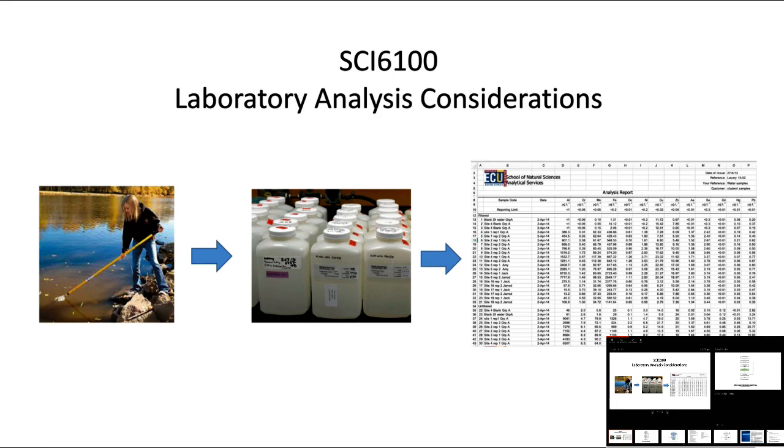You may do that in your own laboratory, or more frequently these days we would send it off to a registered analytical laboratory and they would provide the information back to us. Whether you're going to do this in your own laboratory or whether you're going to use somebody else's laboratory, it's very important that you understand some key concepts around how you do the laboratory analysis and how you can assure yourself of the quality of that. And that's what this module is about.